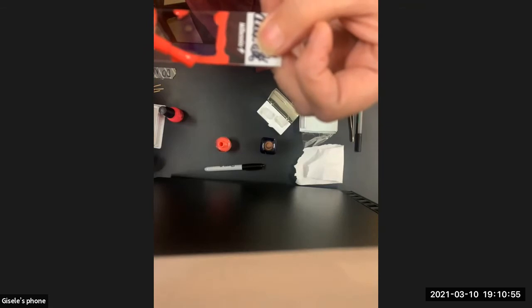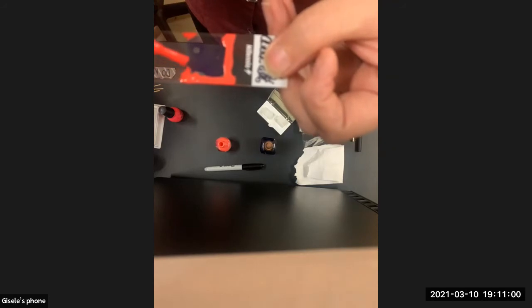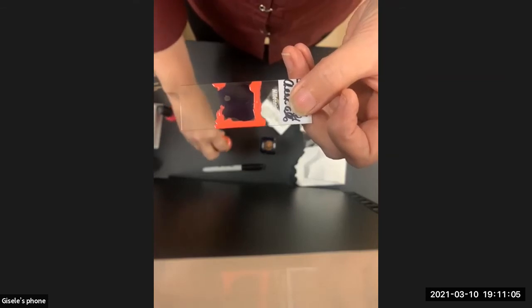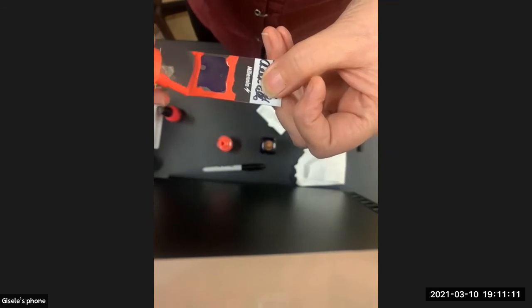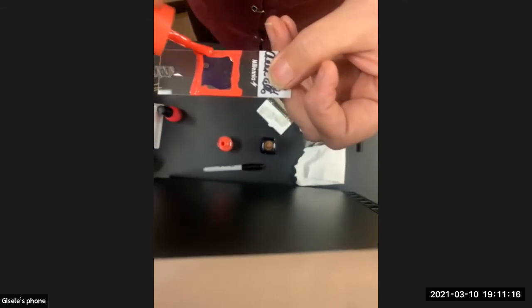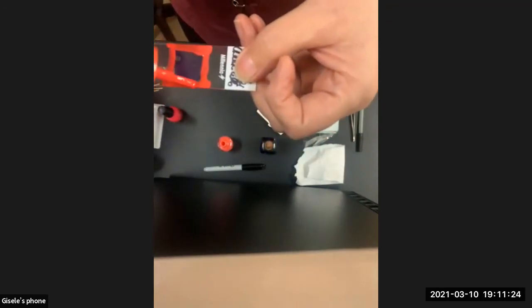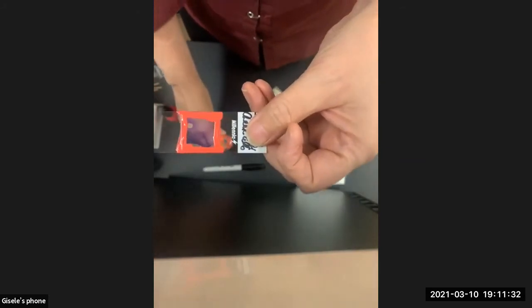You can also, sometimes I just dot, dot, dot if it feels like it's going to move. But basically, you give it your first coat. And if you're like me, you're very impatient and you want to look at what's under there. Notice I'm doing kind of a bad job of this because I'm covering up a lot of my specimen. But if I have cheek cells, I know they're in the middle. It's probably okay. I probably should have put some acetone because it's a little thick. But there you go. That's the first coat.